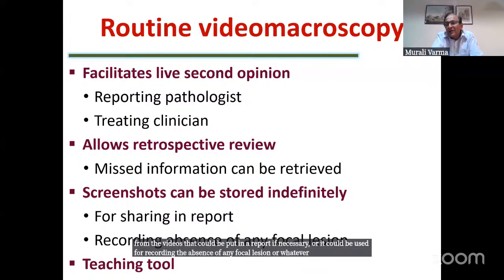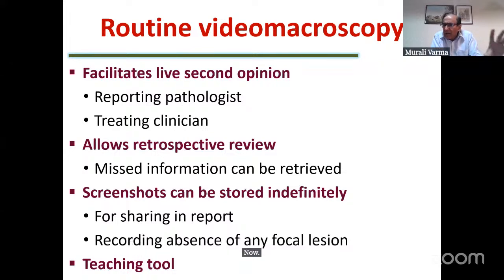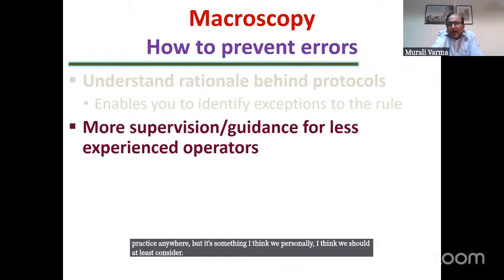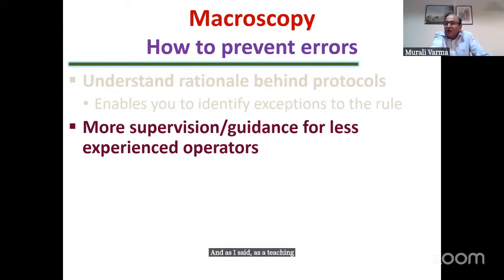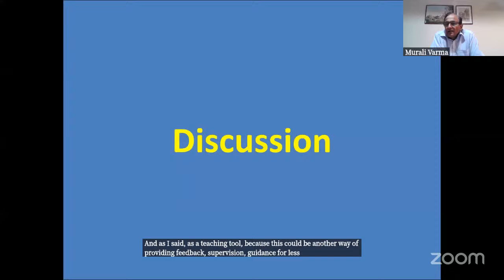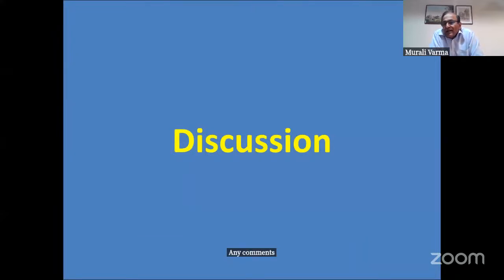And finally, it would form a useful teaching tool. Now, whether this is feasible, I don't know, right? This is not standard practice anywhere, but it's something I think we should at least consider. And as I said, as a teaching tool, this could be another way of providing feedback, supervision and guidance for less experienced operators. Any comments on descriptions and microscopy and the photography?